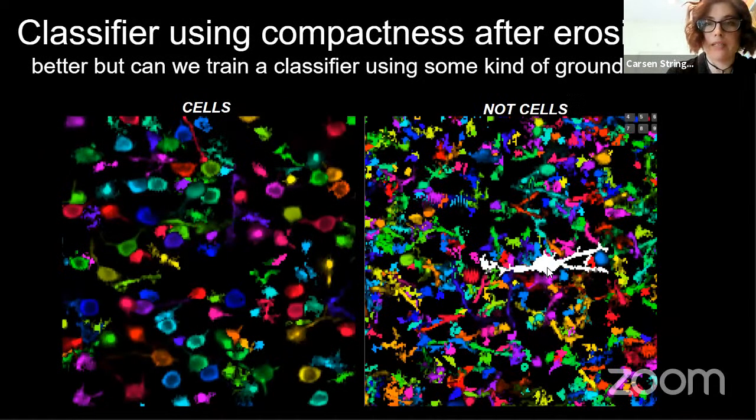And so there's still some cells that aren't perfect, but we're able to get more of these cells on the left now with these dendrites. You can see here with these processes sticking out that were actually detected.